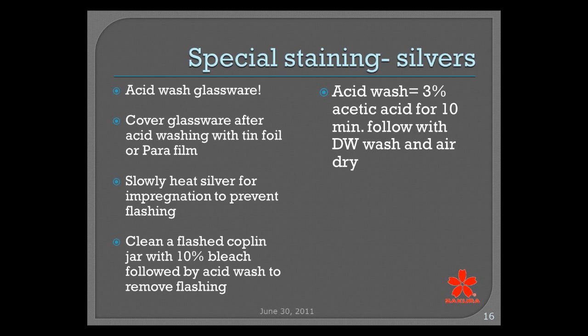Now, when we talk about silver stains, I have found over the years that if you slowly heat your silver for impregnation, you will be less likely to flash your silver. And it's really easy to stick your silver solution in the microwave and push the button, walk away, and then you come back and it's flashed.